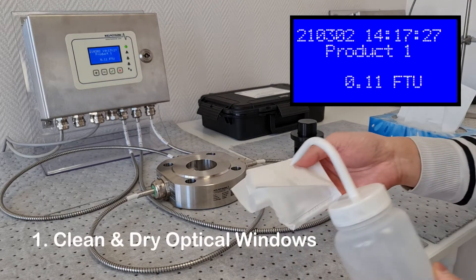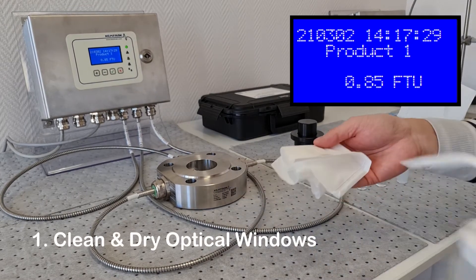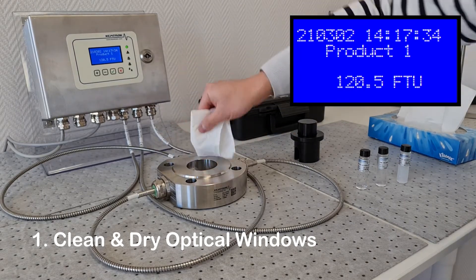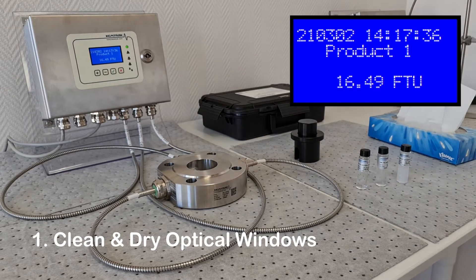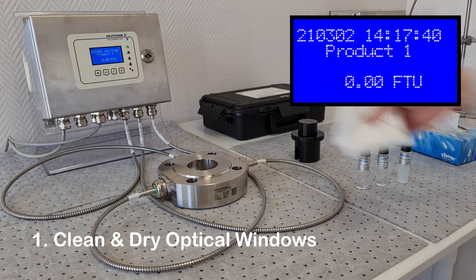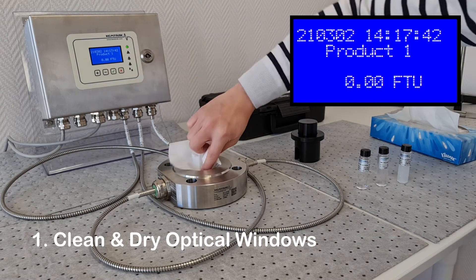Before performing a calibration, it is necessary to clean the sapphire optical windows using a suitable solvent. After cleaning, make sure the windows are thoroughly dry and dust free.